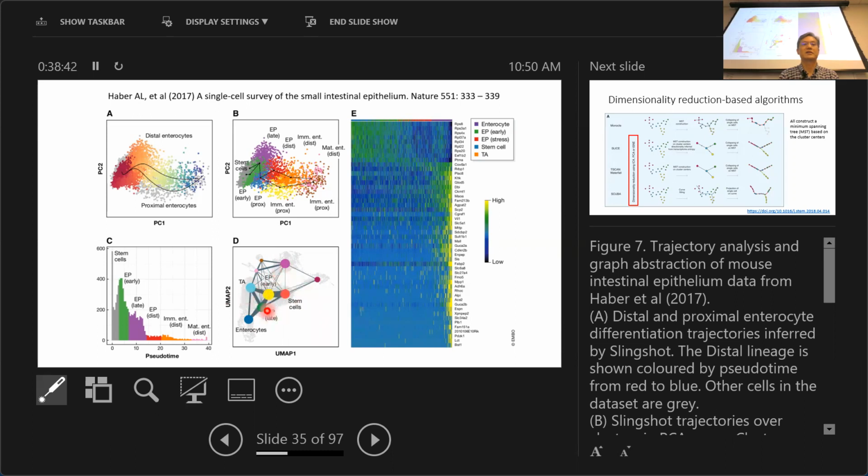But there's some center of the cluster. There are maybe more cells in this one, more cells in that one. They probably use those marker genes and identify the center of different cell types. Then they make a link, and they believe there's a path. Once you have those trajectories, you can have the paths from here to here to here. Once you have paths, you can always find some genes that follow that path and show this kind of change of levels.